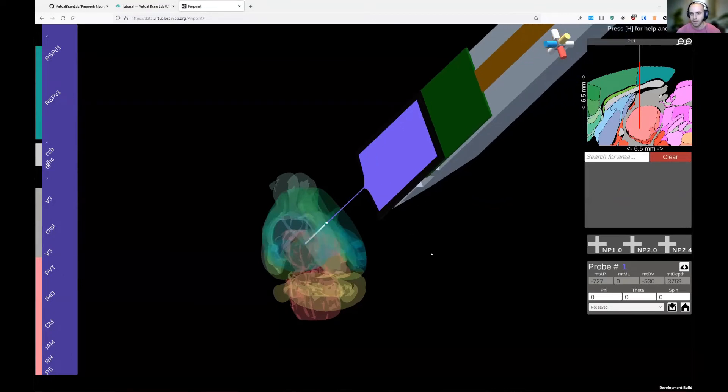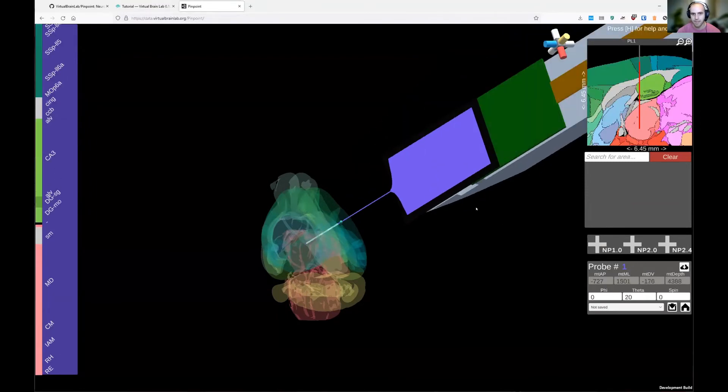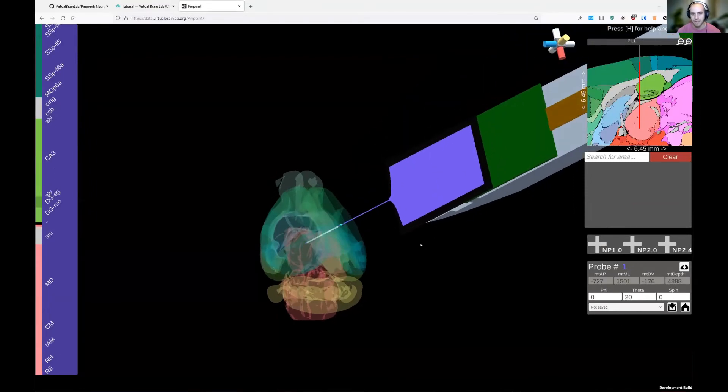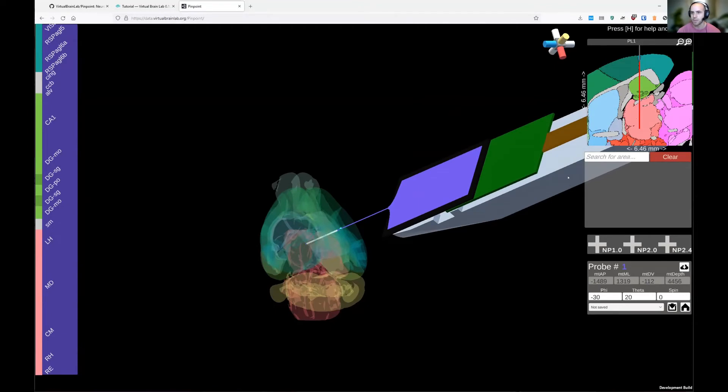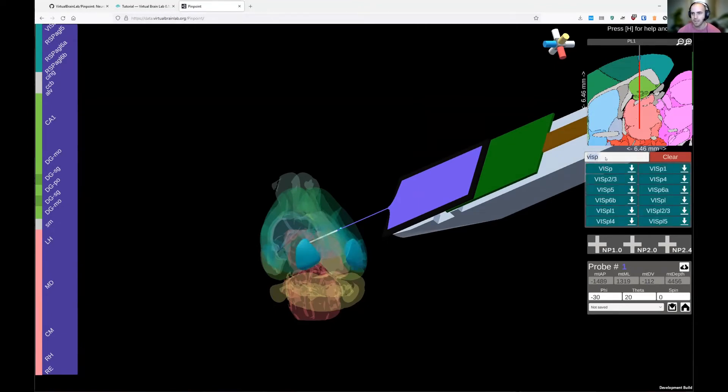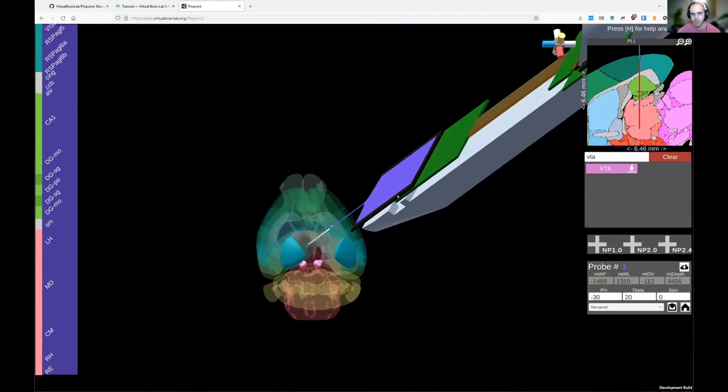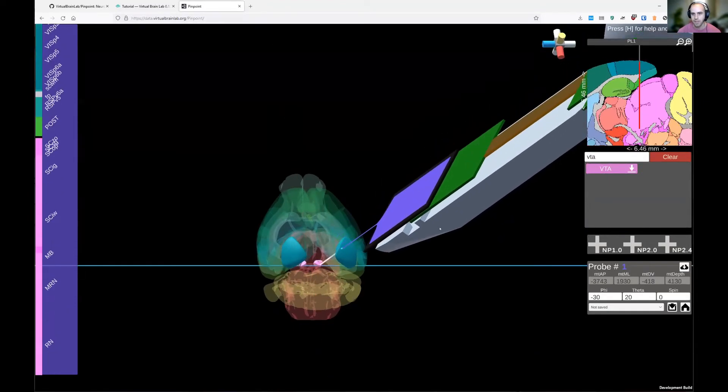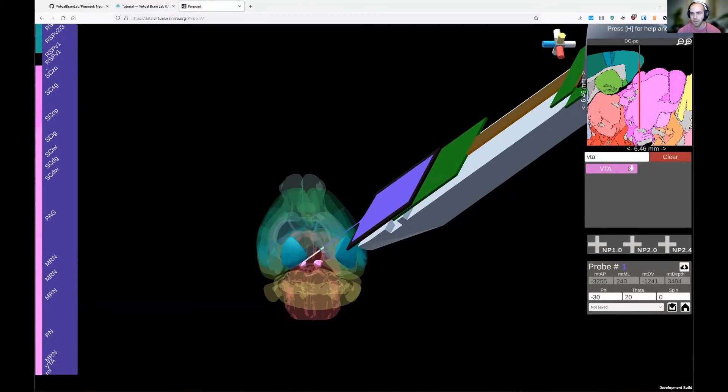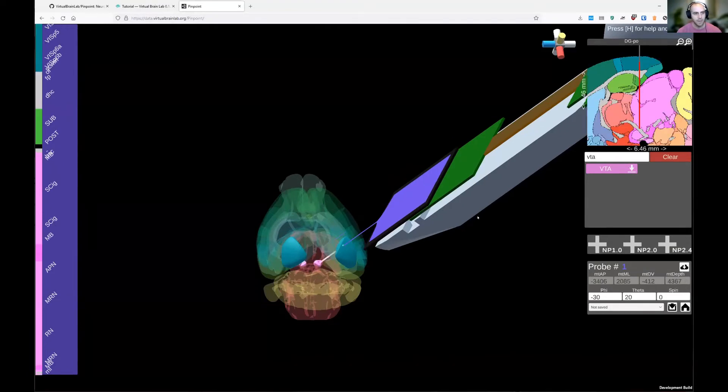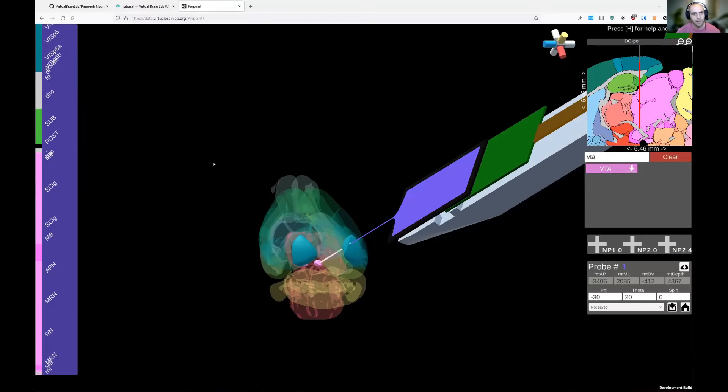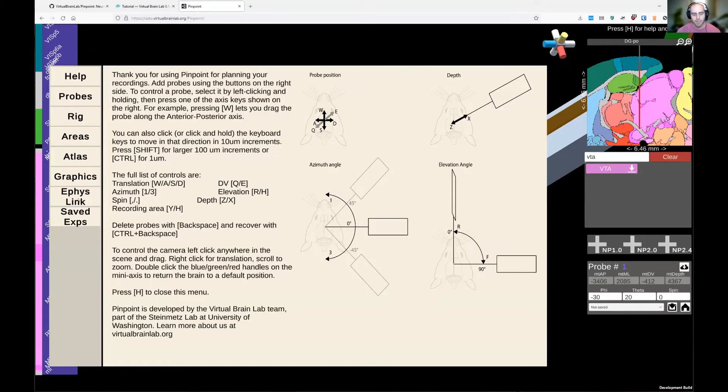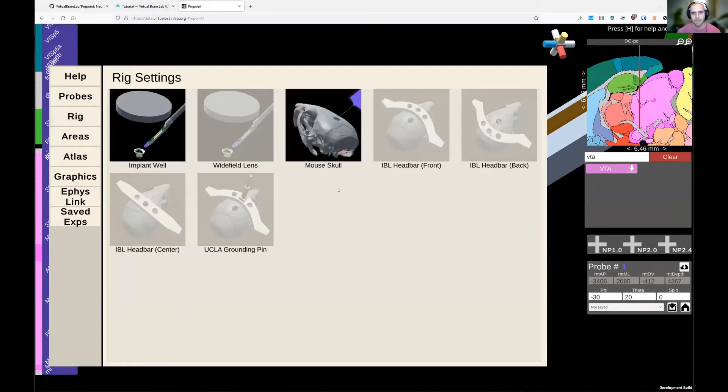Right now I'm clicking the W key to move along the AP axis. And then I'm going to drop the probe in the brain with the Z axis. Pinpoint interpolates along the probe to show you where you are and shows you this in-plane slice on the side to give you context for where you are in the brain. I think one of the nice things about Pinpoint is that it's fast and easy to move this probe around and explore different trajectories.